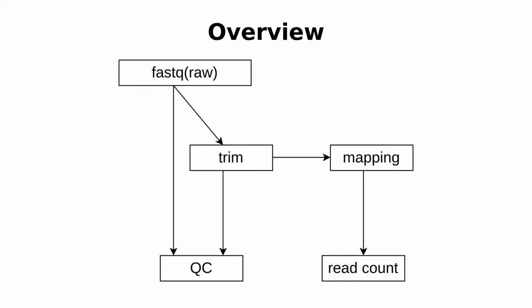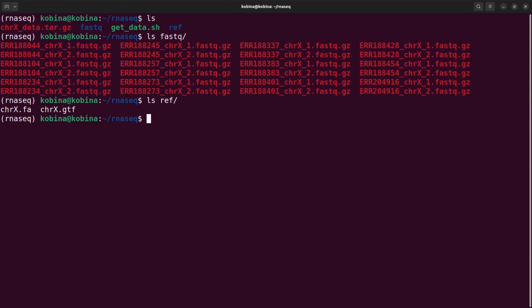Okay, so I will go back to the terminal and then we will start the scripting. Okay, so this is what we are going to do. Now for this tutorial, I will just do a couple of things here. I will blend with my GUI. So in the script, we need to get our data. We already have the data, which is here.